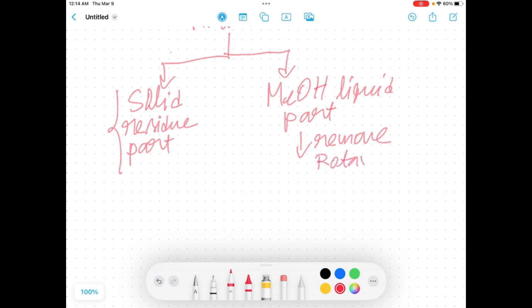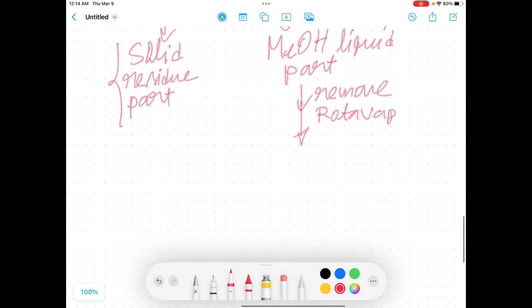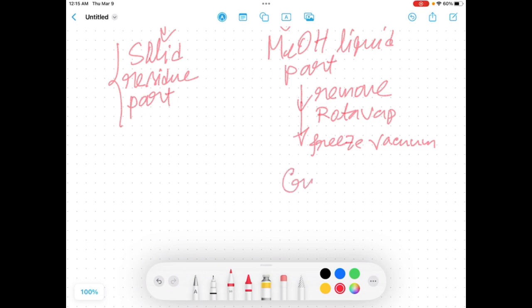Remove the methanol from the liquid part using a rotovap, then use the freeze vacuum technique again to completely dry the extract. You will get another crude extract — call this Crude B.